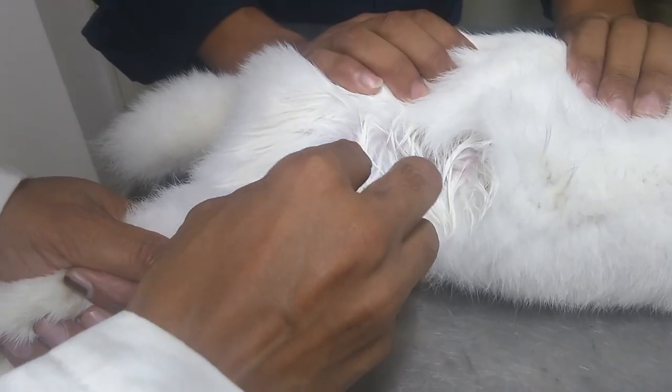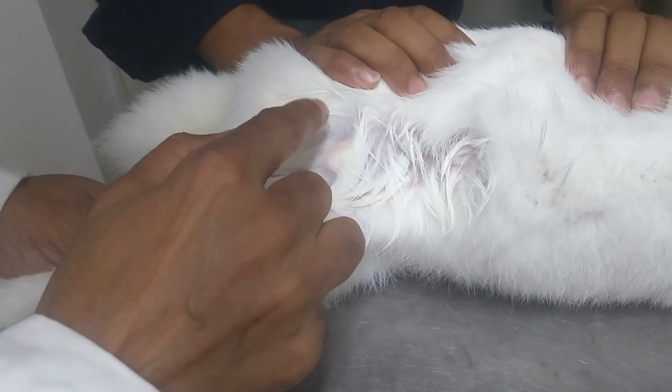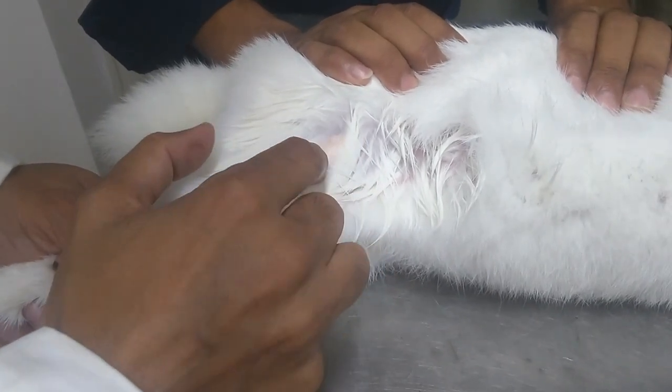So this is a button form which is made. This is the region where the emulsion is lying.